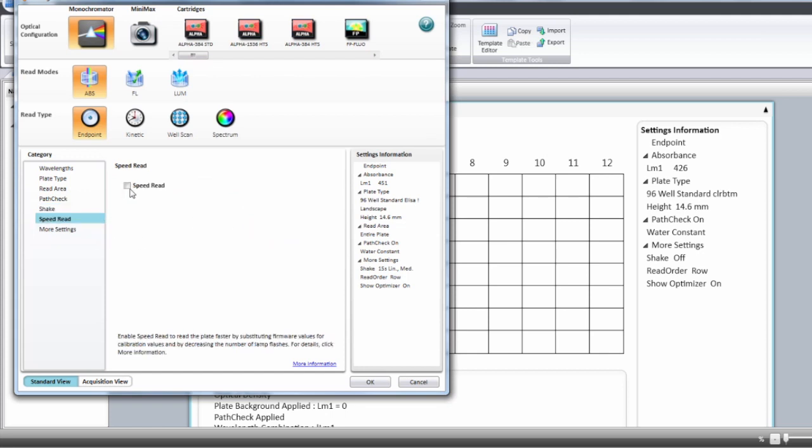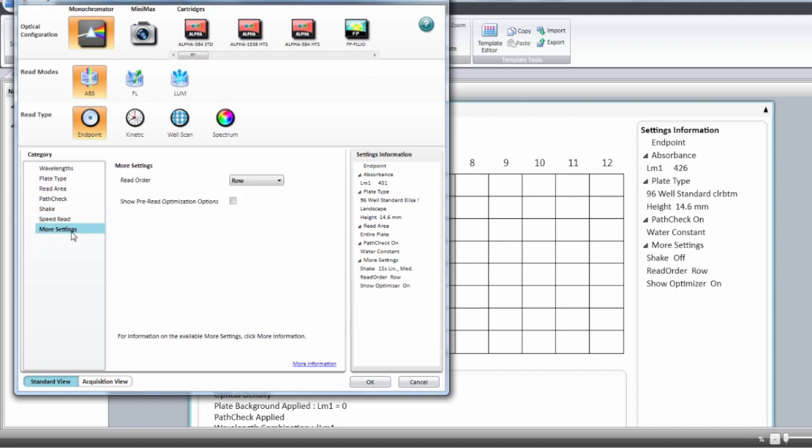Then you can speed up the read and select more settings. The reading order can be row, columns and sometimes well and you have to choose the one that is more appropriate for your read.